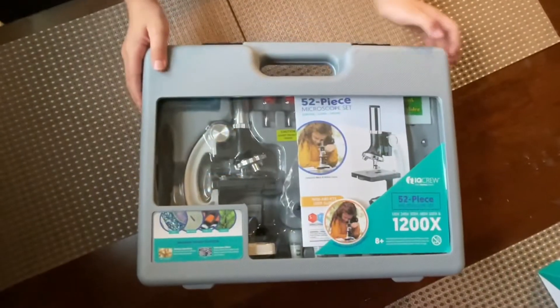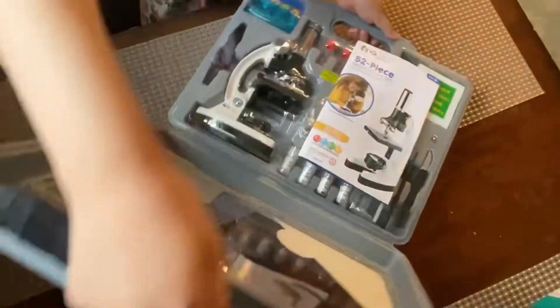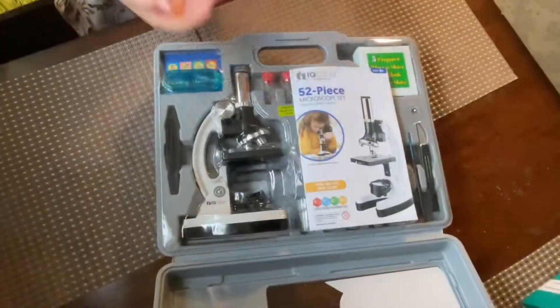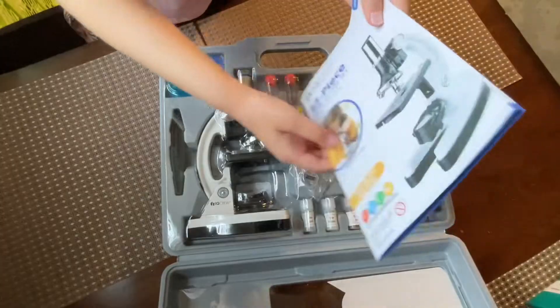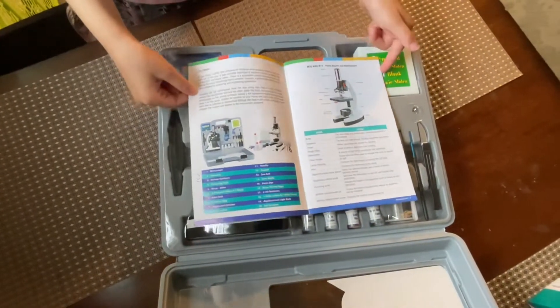So here it is. It comes with a cute carry-on case. It comes with a very handy dandy book. Make sure to read it inside. There's even the parts of the microscope you can learn.